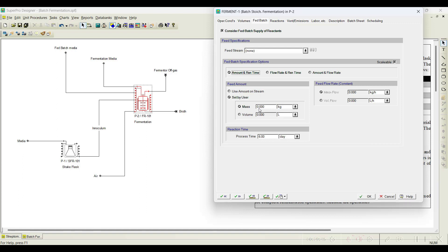I will say around 1000 kg of media for six days — accordingly the flow rate will be set. Or else you can set the flow rate; for example, if you need to transfer 2 kg per hour of media continuously for six days, then accordingly the software will automatically calculate how much amount of media is required.